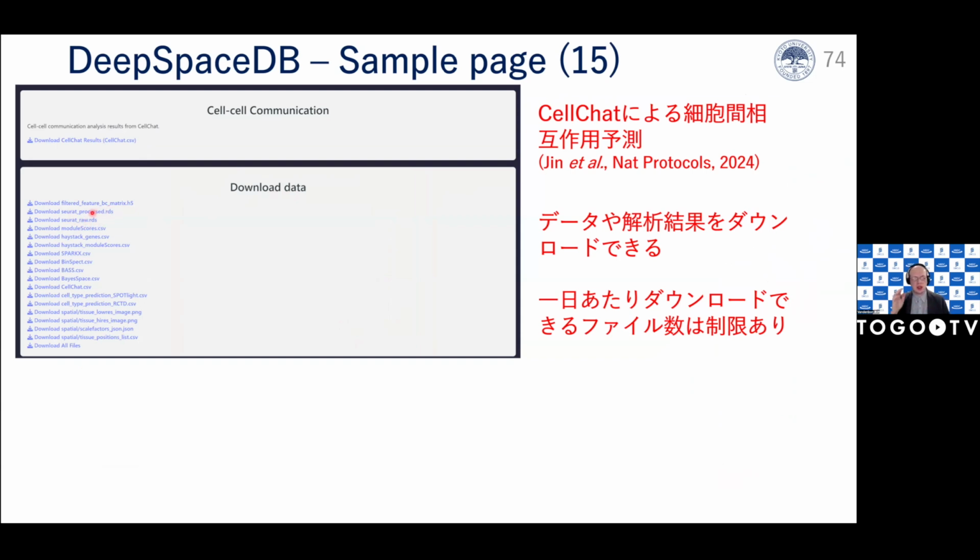If you're interested in already processed data, you can also download it. I think it should be easy to download them, read them into R, and analyze them using the Seurat package. If you have any problems with doing that, please contact me anytime, and if there's some problem, I will try to fix it. So I think I answered that one.